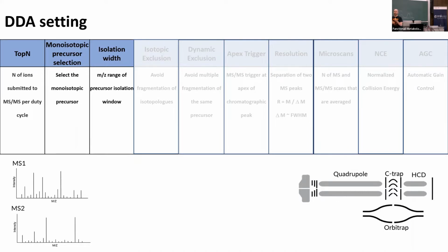So I don't know if they fixed it in the meantime, but that was certainly something you had to know, because I'm used to like 0.5 m/z isolation width for the QExactive, or 1 m/z. But if you use that on our old Maxis, then you probably would have gotten really low signal to noise for your MSMS. So yeah, here this needs to be optimized.